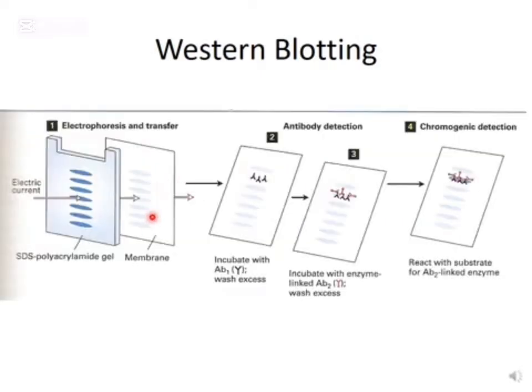So these are the steps for Western blotting. At the beginning, we have an SDS polyacrylamide gel. This you can review in the 1D electrophoresis slide set, which is the previous slide set. Once the proteins are distributed based on their mass using SDS polyacrylamide gel electrophoresis, these bands are visible only by staining the gel after the protein is distributed, or before. It depends on the technique used.